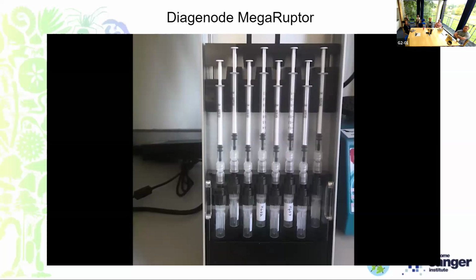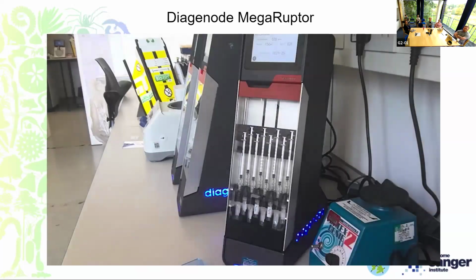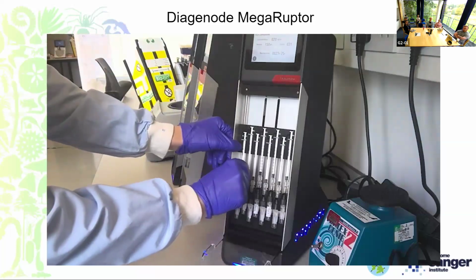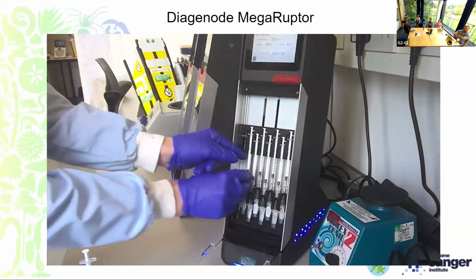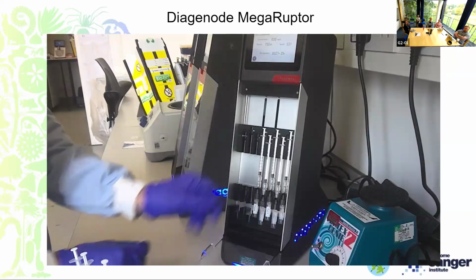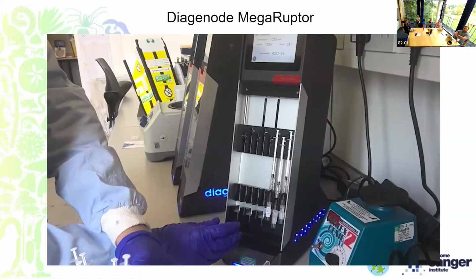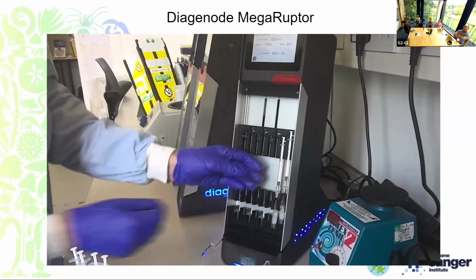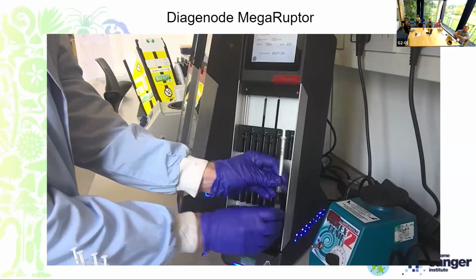The length of time for a run in the Megaruptor is roughly 25 to 40 minutes, depending on your volume and your concentration. Once the run is finished, we pop out the samples, take off the syringes, and expel any DNA that's still in the hydropore. After this process, there's potentially some DNA within the hydropore, so it's important to get out all the DNA that you can and push the plunger down so that you've kept as much DNA for the next steps.